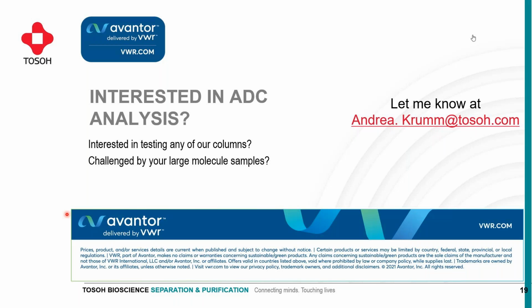Okay. Another question concerning mass spectrometry. Is any of the presented methods compatible with mass spectrometry? Good question, and not too easy to answer actually, because all of the methods I just showed you used salt in their mobile phases, which is per se not well compatible with mass spectrometry.